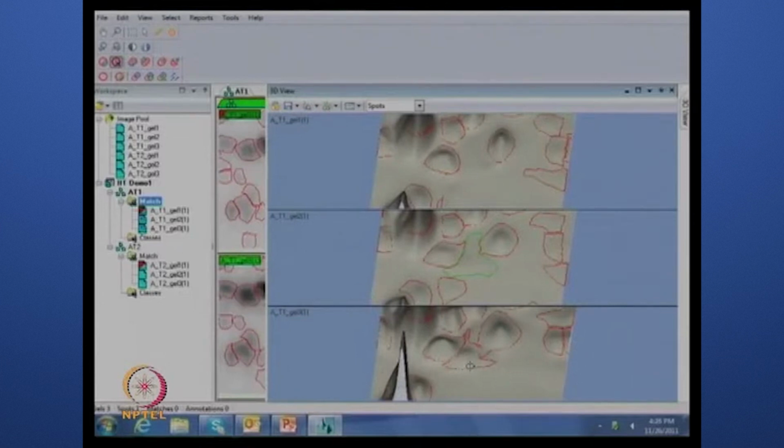Finally we can see the statistical data, whether it is there in both gels as well as treatment also, so that one can go with the statistical parameters. This will be helpful there. So there is no need of deleting in this case. Now let's look in detail at one of the real spots.